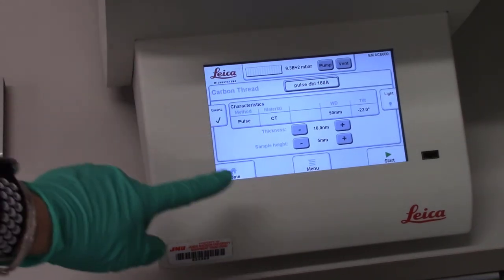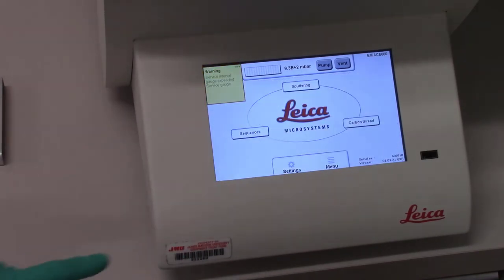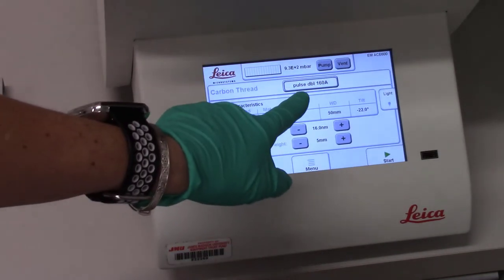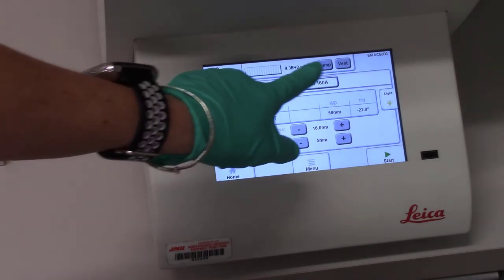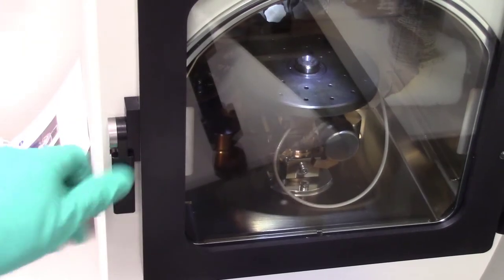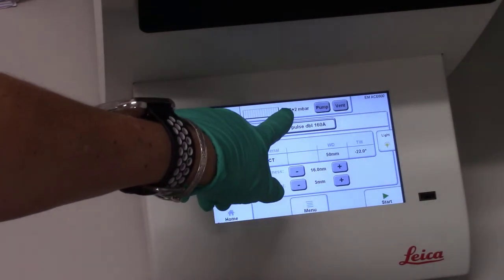So I just want to show you here, this is the screen for the carbon coater. We can go to the home and it'll show this. We're going to do carbon thread, so we want to push carbon thread. And we get this program called pulse double 160 angstroms. That is just the setting that we're going to use twice on our samples to coat them. So you can see here at the top it says pump and vent. Vent is to bring the pressure back up inside the sample compartment so that you can open it. And then pumping is to increase the vacuum, so to reduce the pressure. And this is the pressure in millibars.